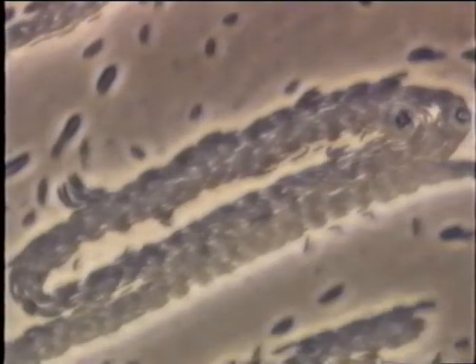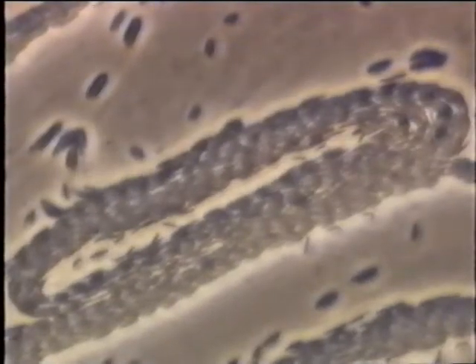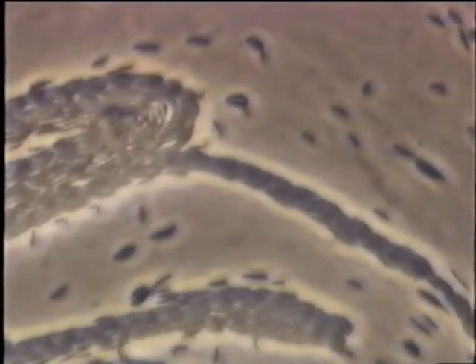These bacteria are on non-nutrient agar right now, but close by there's a source of nutrient, the bacteria called Micrococcus luteus, and later you will see them eating Micrococcus luteus. More gliding motility. The mechanism of gliding motility is unknown. It requires a solid surface, and the cells can move either forwards or backwards.